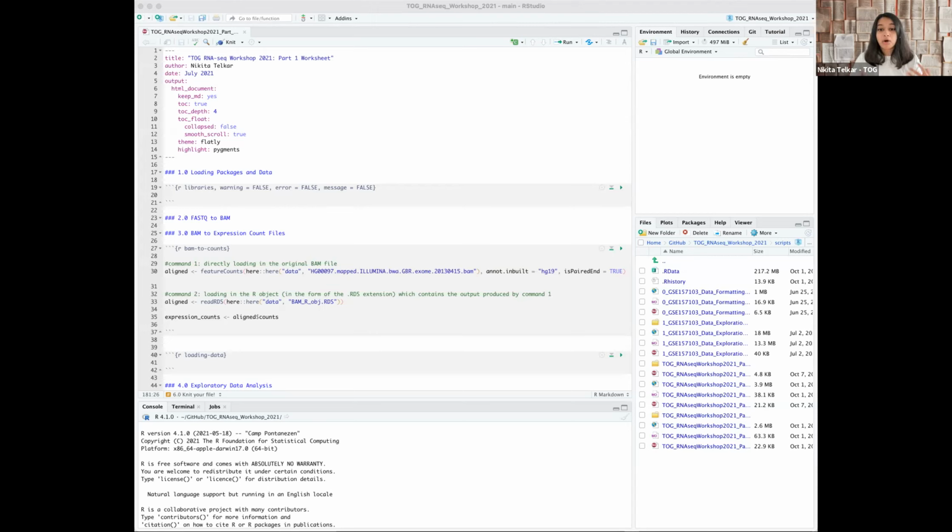So depending upon what type of RNA data that is, there are a few pre-processing steps that you will have to perform. However, given that a FASTQ file is a couple of gigabytes, we will not be going through that. But if you go into the part 1 MD file in the scripts, you can see an image that displays what the data in a FASTQ file looks like.